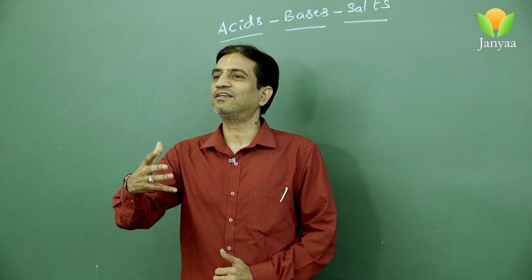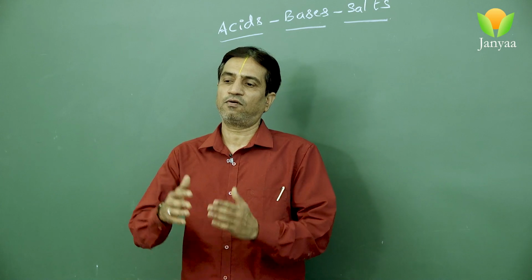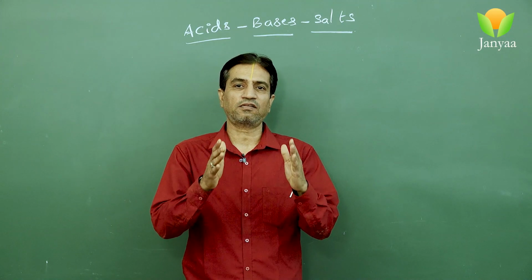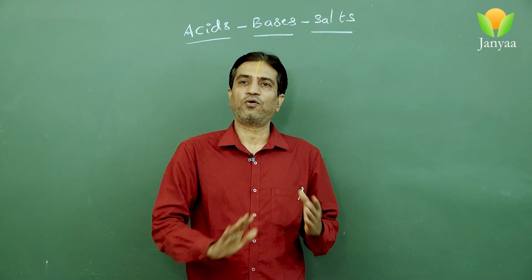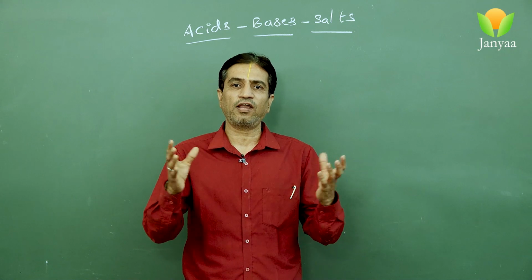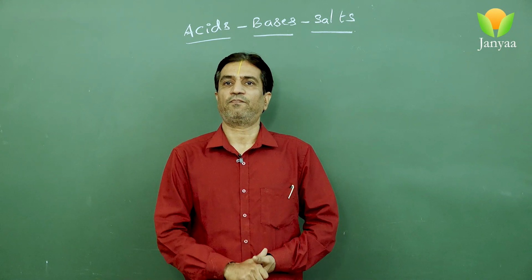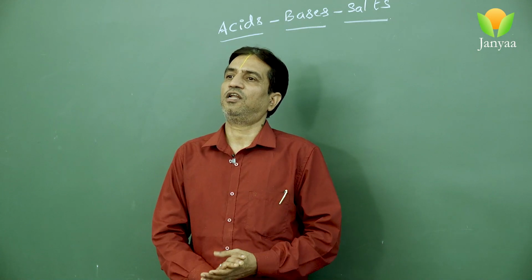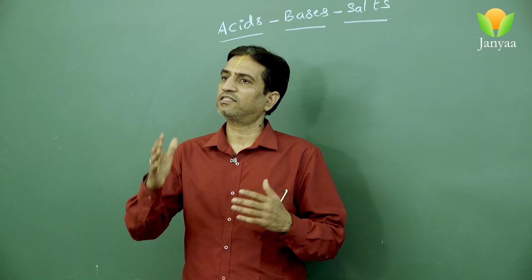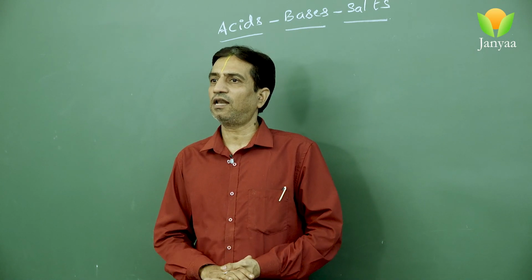In which type of nature will the plants grow more, do you know? If the soil is neutral, in those fields the plants and every crop will grow more and we get more yielding. So, in this session we are going to discuss how to test the soil and what the nature of the soil is. For that we require some material.